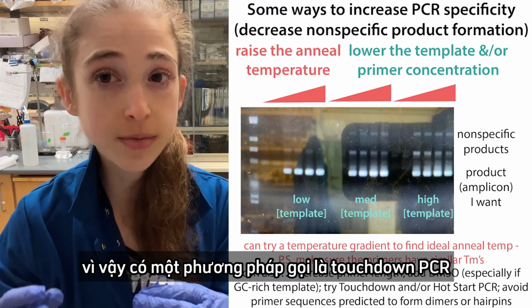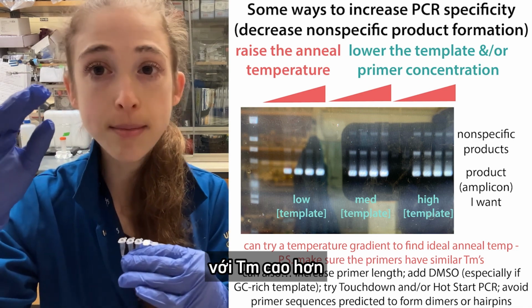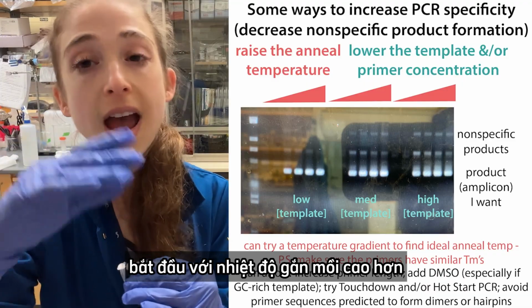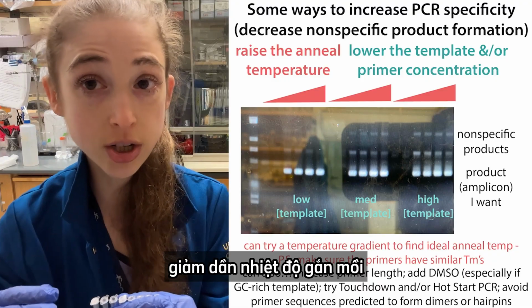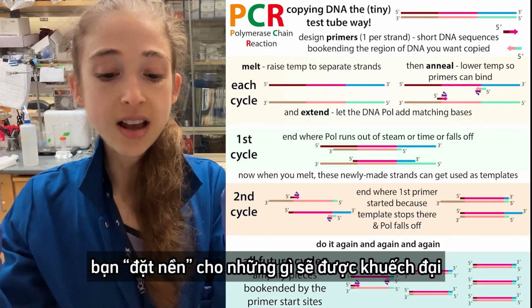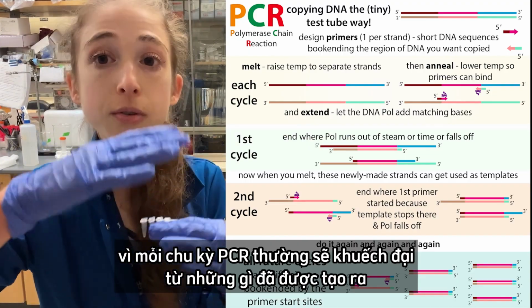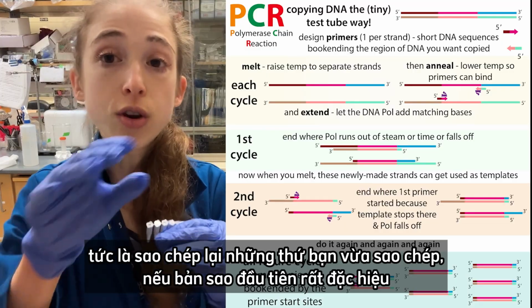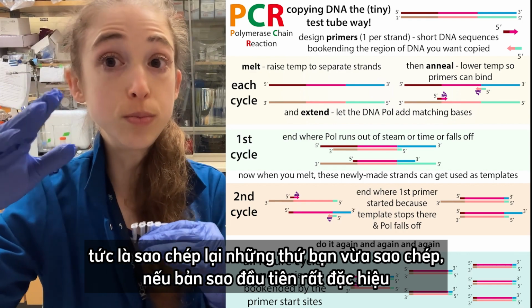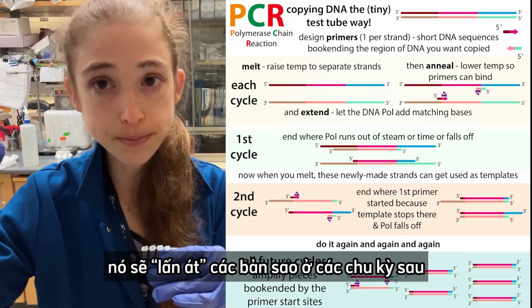So there's a method called touchdown PCR, where the first cycles start with a higher TM, and then in subsequent cycles it lowers the TM. It starts with a higher annealing temperature, and then in subsequent cycles it lowers that annealing temperature. Now what this means is that in that first cycle, you're setting the scene for what's going to be amplified. Because remember, each cycle of PCR, you're amplifying what you already amplified typically. And so you're making a copy of those things that you copied. And so if that first copy you make is really specific, then it's going to swamp out the copies in the later cycles.